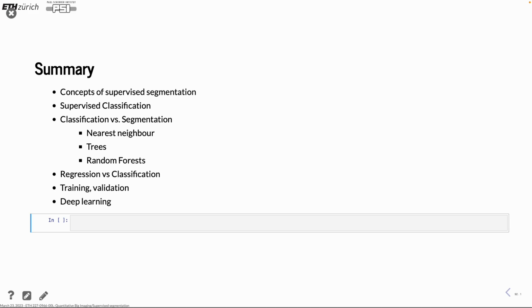So we looked at different ways to automate the segmentation. There are very many approaches. What you usually start with is some histogram-based method, and then you can go into clustering or supervised classification. And all this testing can be supported by using, for example, pipelines.